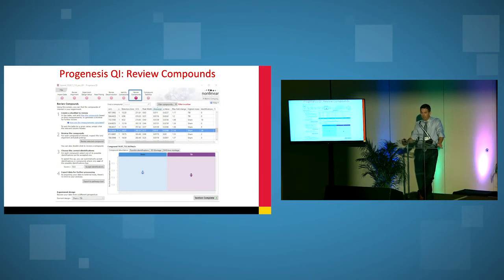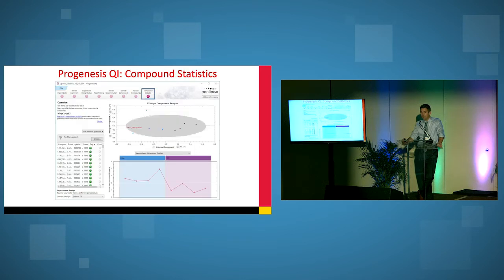Another view with Progenesis, you can review the compounds. There's a variety of parameters on this screen as well. And there's also some compound statistics as well here showing the PCA plot here showing that the sham versus our TBI are well separated.